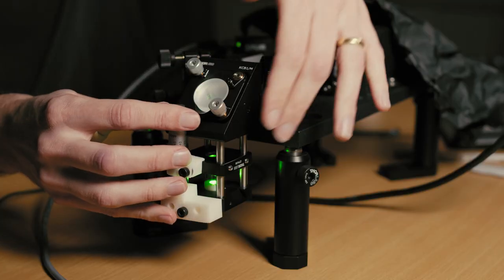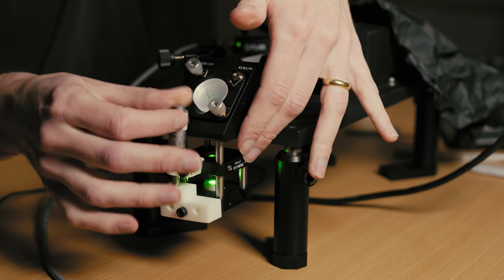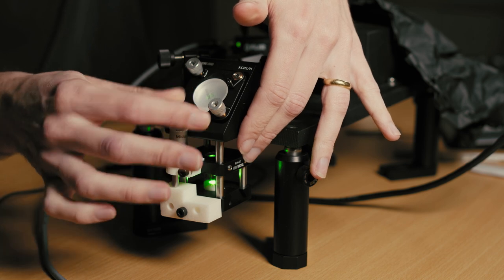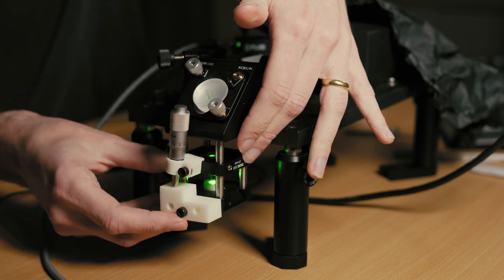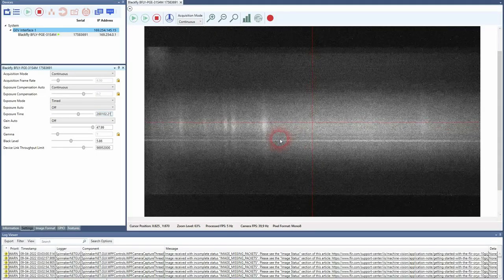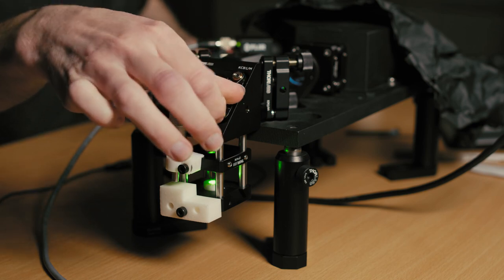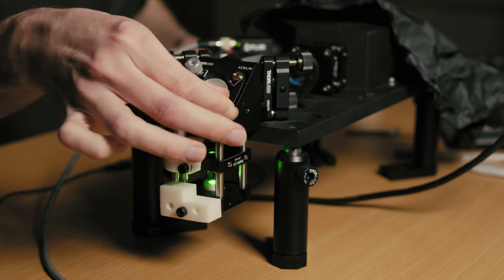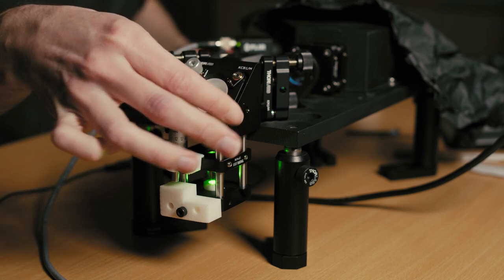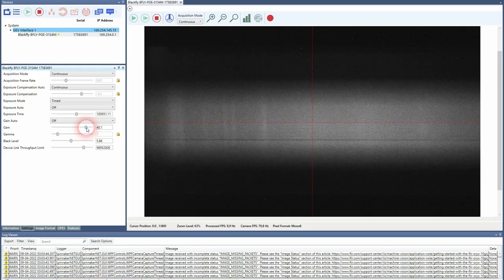You can also now try to go lower or higher. So you can also move this laterally.